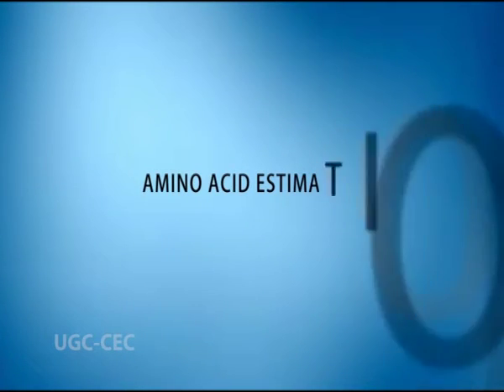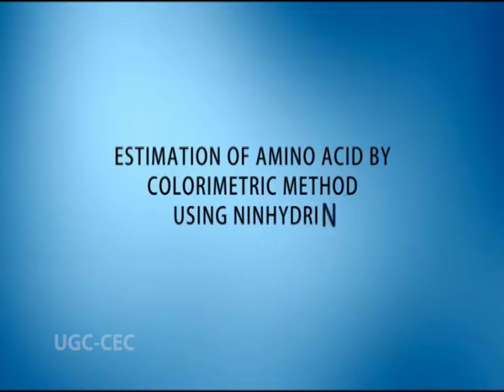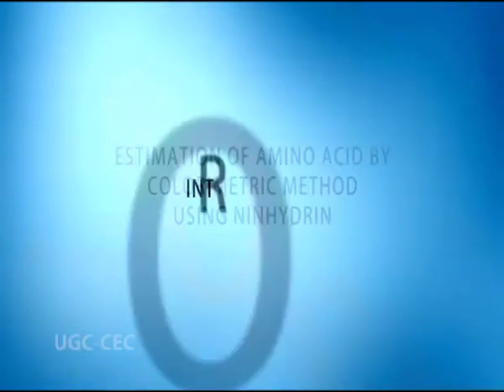The second experiment is the amino acid estimation. Estimation of amino acid by colorimetric method using ninhydrin. First, the introduction.